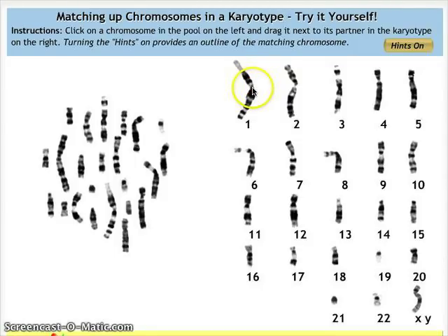We also look at the banding patterns. You can see the dark banding patterns in the bottom half of the chromosome, along with four darker banding patterns following it. So we look at the location of the centromere, the banding patterns, and also the length of the chromosome.